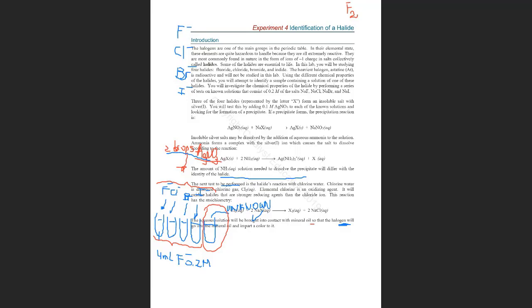Don't confuse with soluble. S is a solid. So basically, you have a salt that is solid.